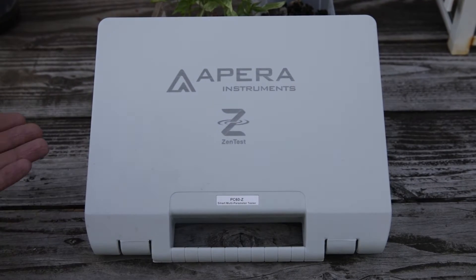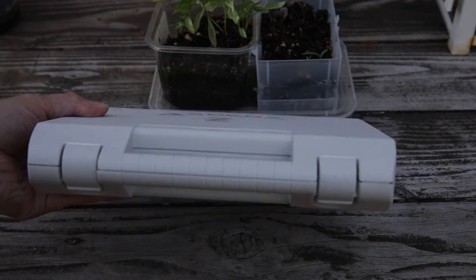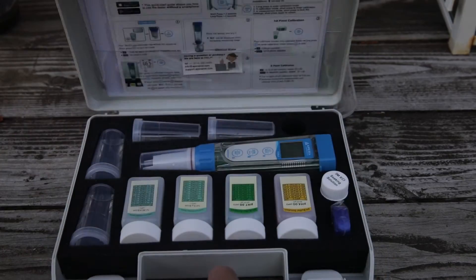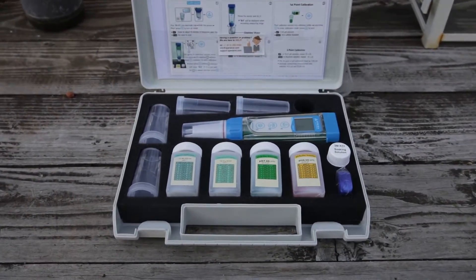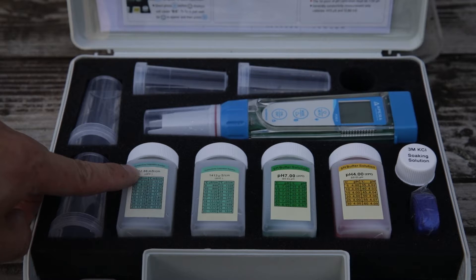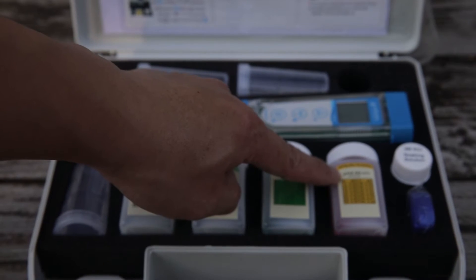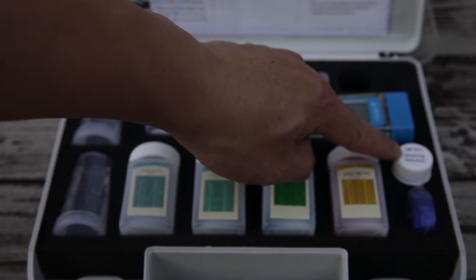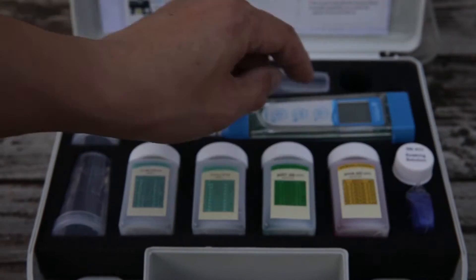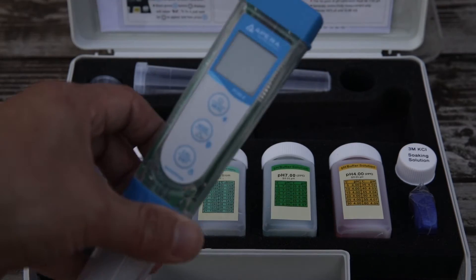What's nice about this kit is that it comes with a hard carrying case to keep your instrument safe and protected. The kit comes with two electroconductivity standards, two pH standards, a storage solution for long-term storage, a strap for your instrument, a four-slot testing solution case, and your tester instrument.